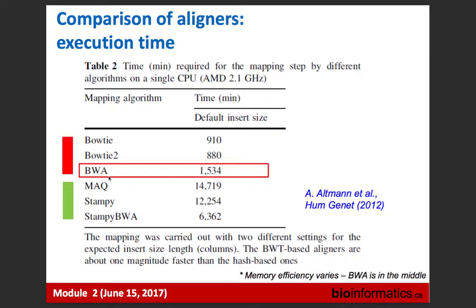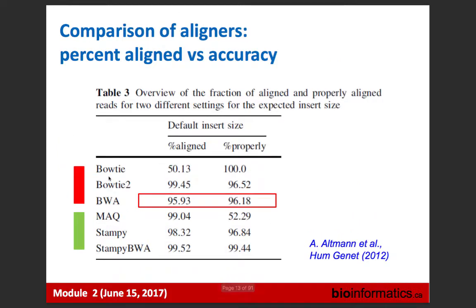And that's the aligner we use at Genome Sciences Center in Vancouver, in production and in studies. Well, so now, what is the second? Of course, speed is not everything. What else would we be interested in? How accurate our aligner is, and how sensitive our aligner is.